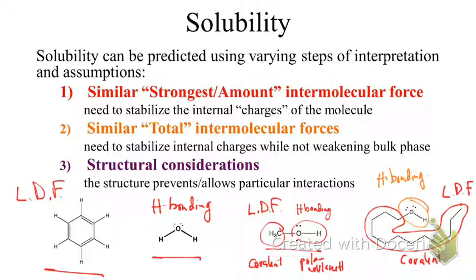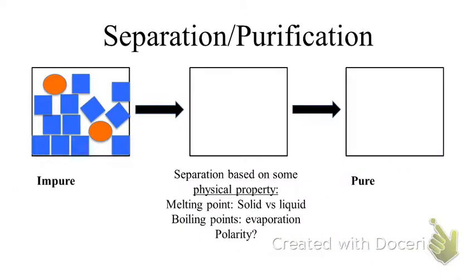So now what we're going to try and do is apply solubility, see what we can do with it. We're going to use it as far as we're concerned with separation, but if we want to sound a little fancier, we can call it purification. Okay? The technique that we're going to look at this week is going to be recrystallization, okay? Which is primarily a purification technique. It's not quite as nicely described as separation.